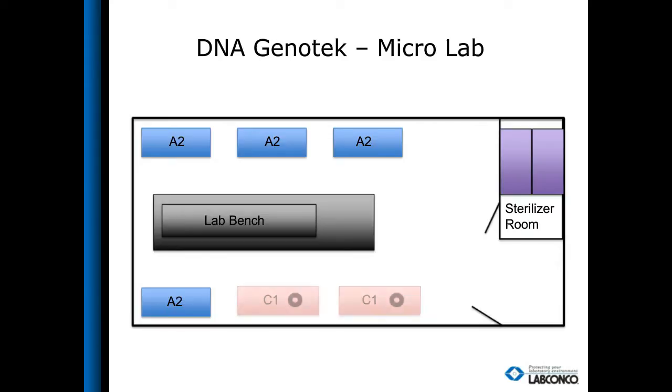By adopting the Class 2 pending definition with ANSI, with NSF, the C1, what they were able to do was maintain their chemical protection that they were requiring, but use the existing designed mechanical system that manifolded them together, where the Bs would fail. To convert to the A2s that were ducted, as you see here, they would have sacrificed the safety.